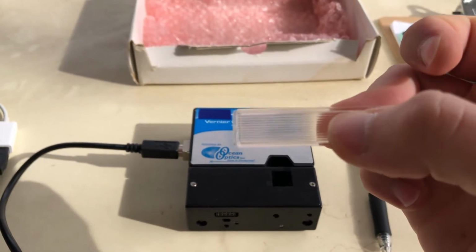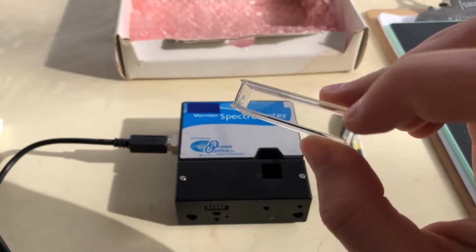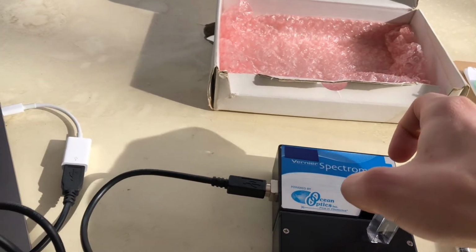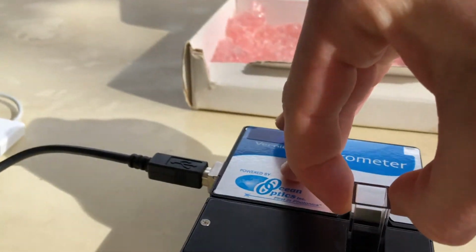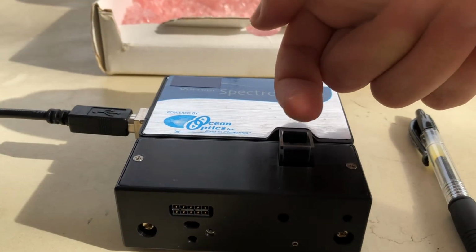Now notice that there are ridged edges and flat edges or clear edges. So the light, you would obviously want to go through the clear edges. So I would be facing it just like this. So the light would be going through the clear edges as opposed to the ridged edges, which is the difference between the side that you're supposed to hold and the side that you're supposed to have the light go through.